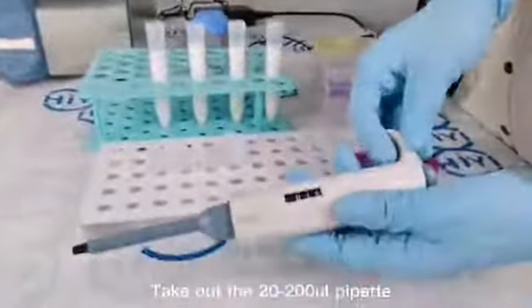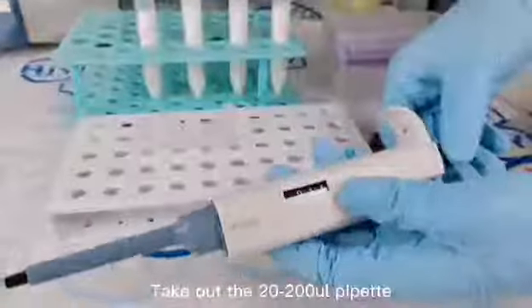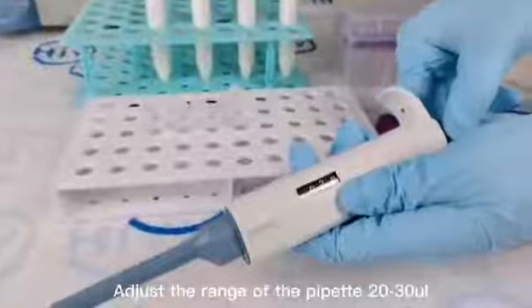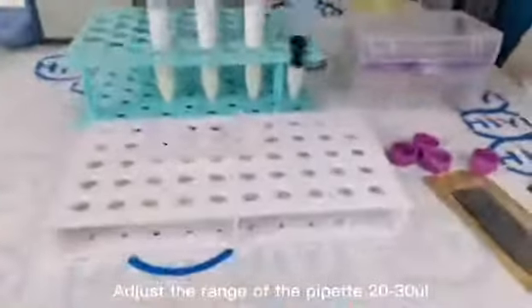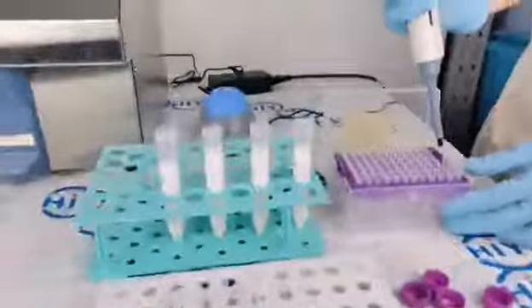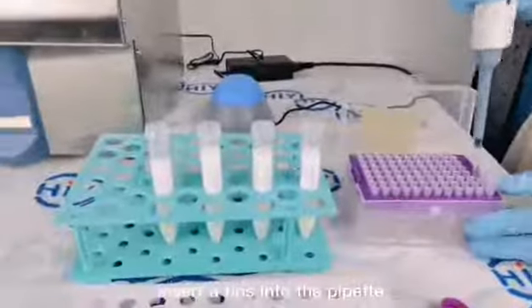Take out the 20 to 200 microliter pipette. Adjust the range of the pipette to 20 to 30 microliters. Insert a tip into the pipette.